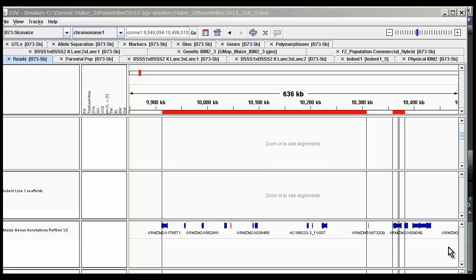Hi everybody. This video will serve as an introduction to Energene's visualization system and to our multi-genome capability in this visualization system. This system is based on an IGV viewer from the Broad Institute, which we have significantly improved. One thing we did improve is add tabs.